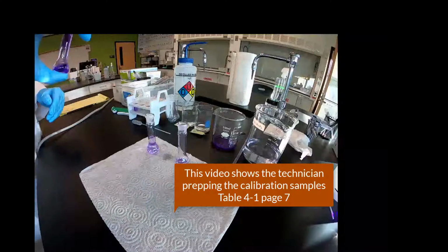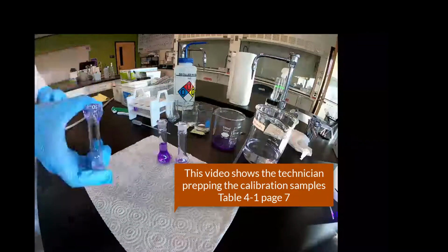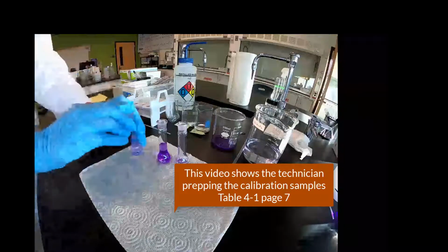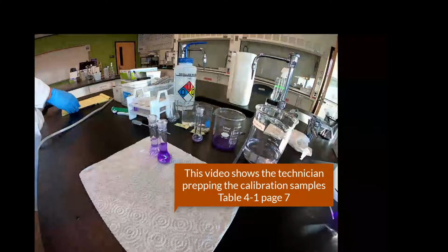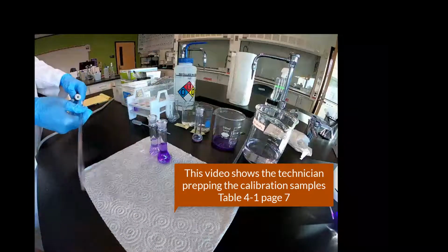Now he's using his gloves, but we also have parafilm to wrap over there. That way you don't do a little cross-contamination with your gloves. That can be a problem. So I tend to put parafilm over that. It would be a little better technique. But now we have sample number 2, which is the next dark sample. And then you have sample number 3, which is the 1 to 10 sample.